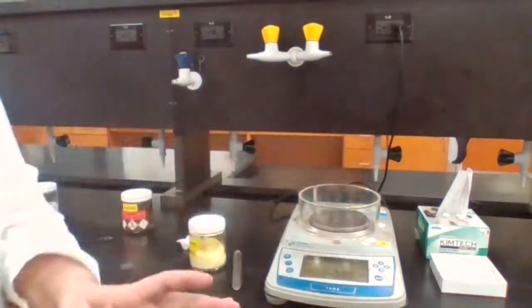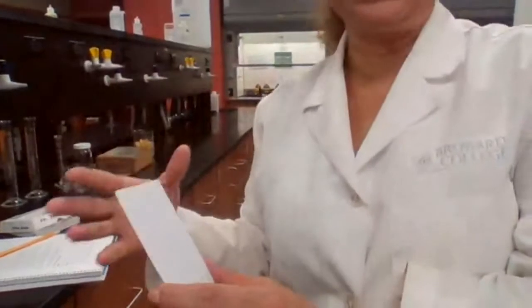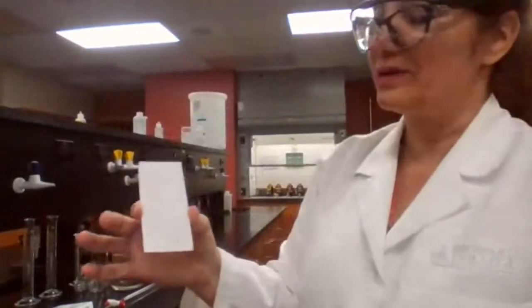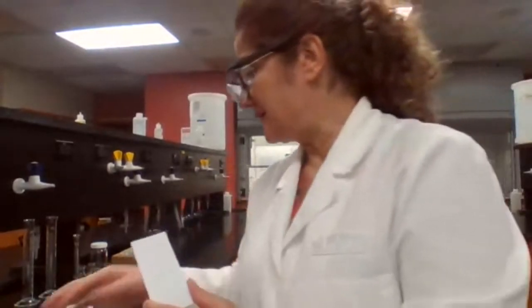And I think now that the UV lamp is ready, let's finish up with the TLC and then we stay only with the column chromatography because it requires a lot of attention. You have to be constantly working. Two people are needed, but I try my best to perform the experiment by myself because we can never dry this sample, and I'll explain later. But let me finish with the TLC first.